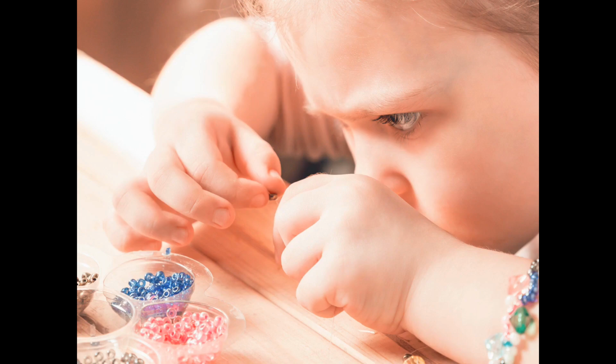Just like making the perfect friendship bracelet with finicky little beads and string that doesn't sit quite right, realizing that you made a mistake and have to start all over is pretty devastating. That's why it's so important in a complex workflow to make your steps as simple as possible and to be able to check your progress to confirm everything looks right, starting from the very beginning.